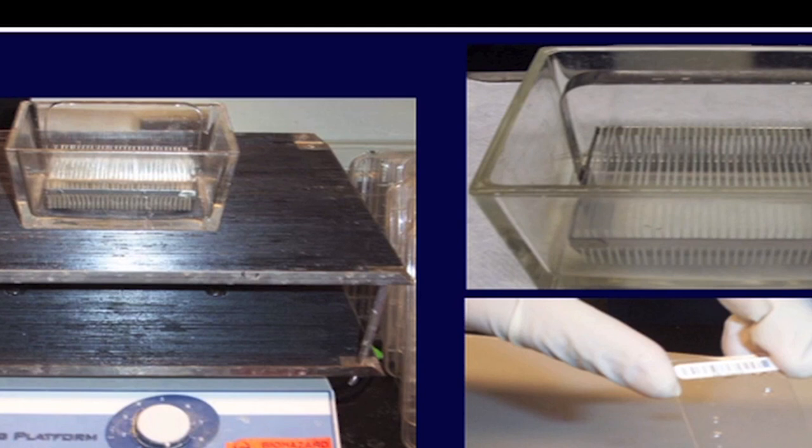On the left side, a rocking shaker has a glass tray with a metal rack containing 30 slides. At the inset, you can also see these 30 slides in the metal rack are submerged in the amino silane solution. On the bottom panel on the right side, I have shown that the slides can be either centrifuged or dried with the compressed air, and those are ready for printing purpose. Amino silane coating is demonstrated in the following animations.